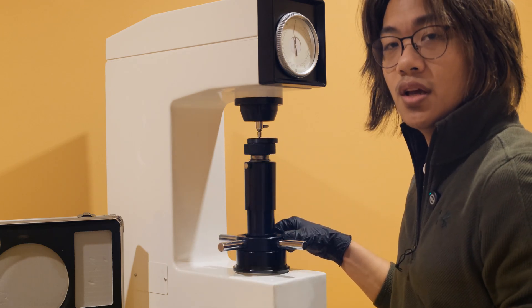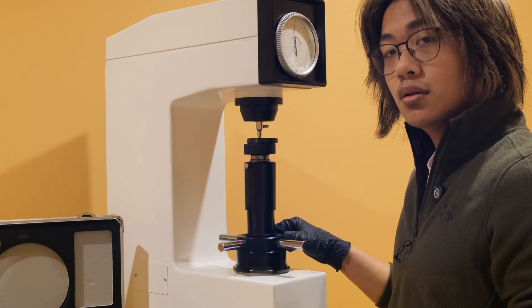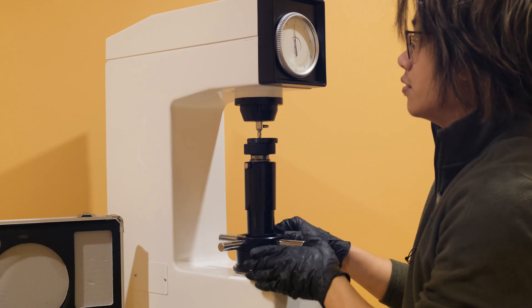Raise the anvil by turning the elevation screw counterclockwise until the sample comes into contact with the indenter head. Continue to smoothly raise the anvil, paying special attention to the indicator. Once the needle completes three rotations, bring it to a stop on or just after TDC.